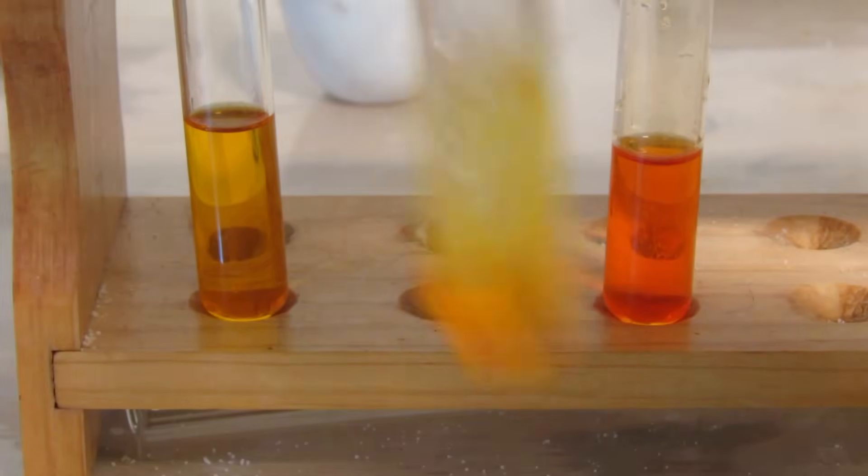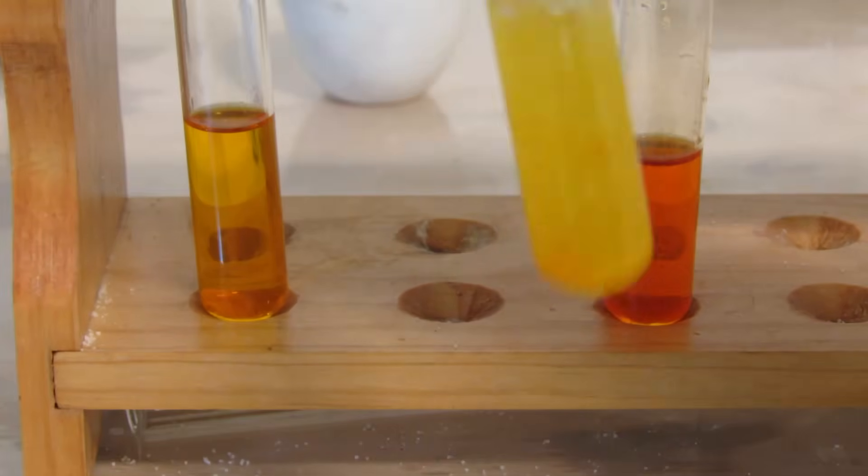Now stopper the test tube and begin shaking it. The yellow bromine color will slowly begin to disappear until it's all gone.